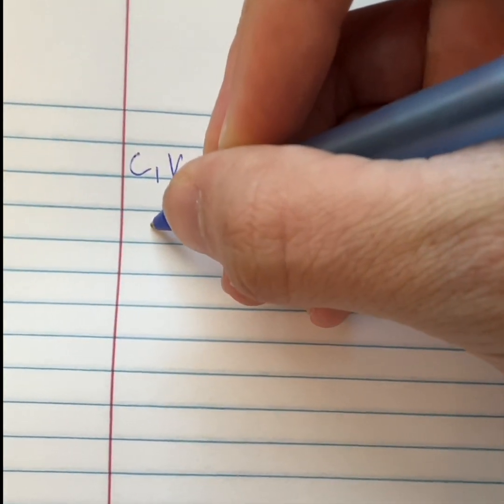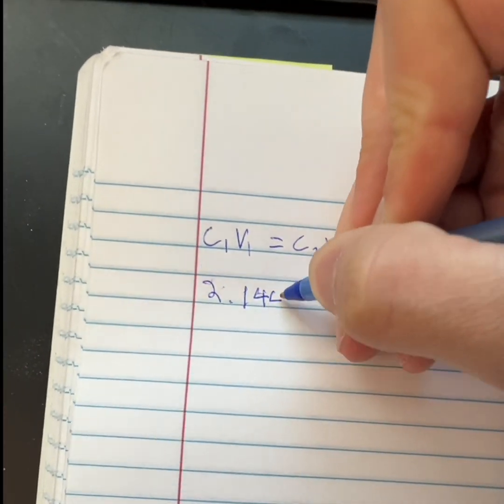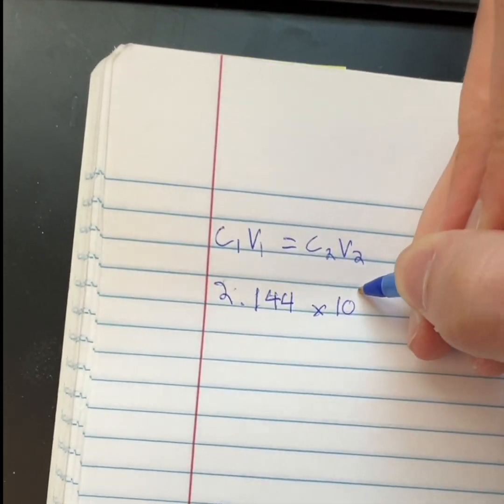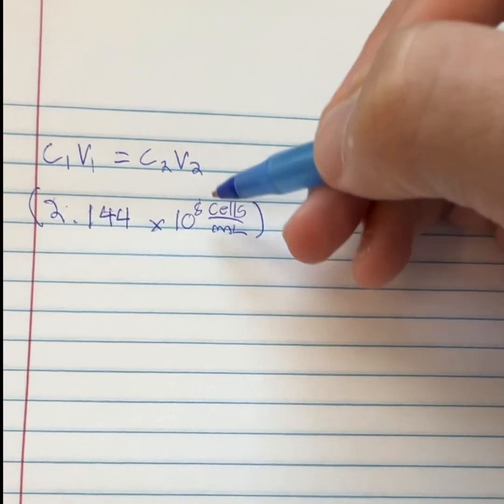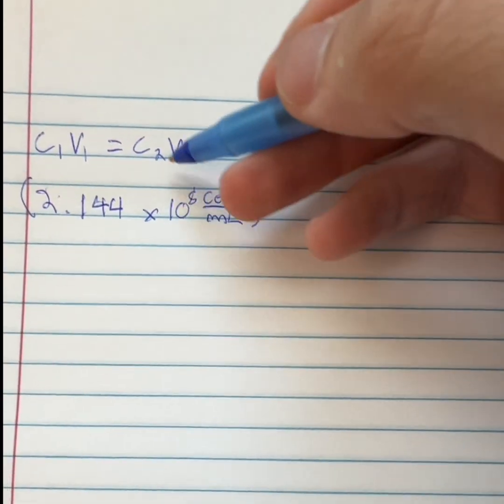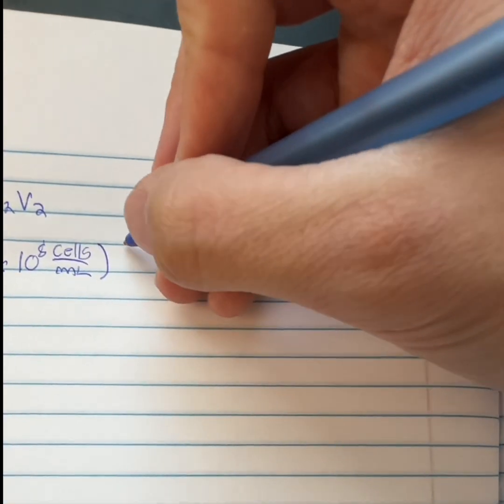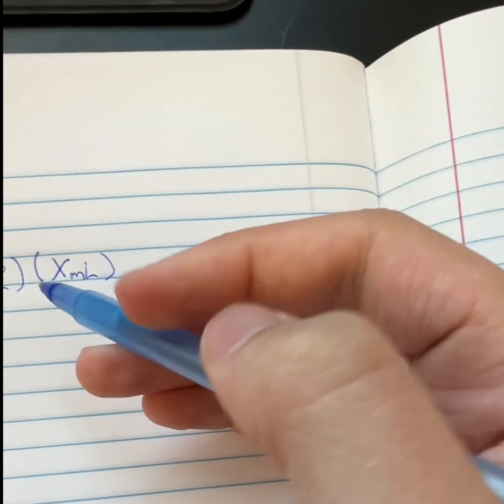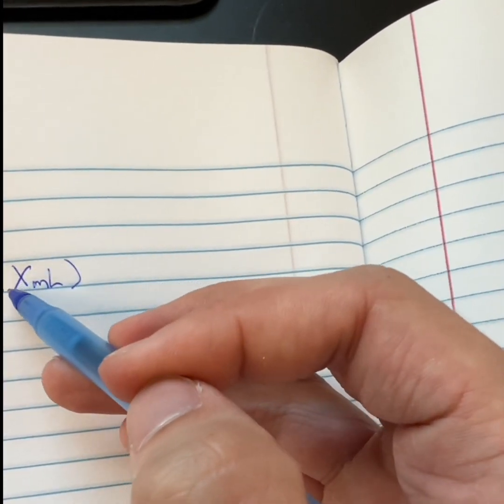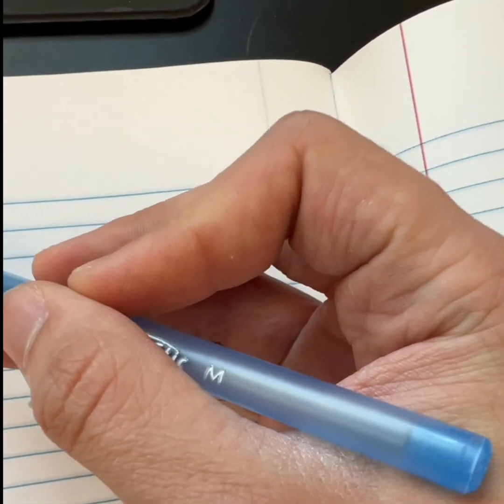We already did our counting and our math, and we got 2.144 times 10 to the 8th cells per milliliter as our initial concentration. So this is what is in our culture that we've already washed 2 times with PBS and resuspended in 20 to 40 milliliters of RPMI. And this is going to be multiplied by X milliliters. We don't know this yet because this is however much of this we are adding to V2 to get C2.